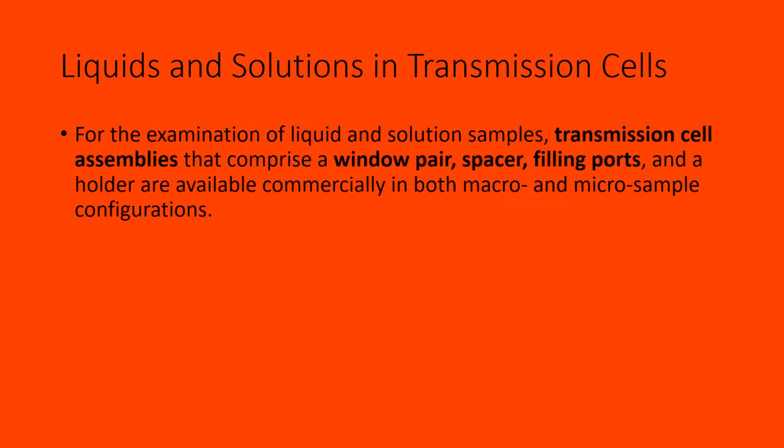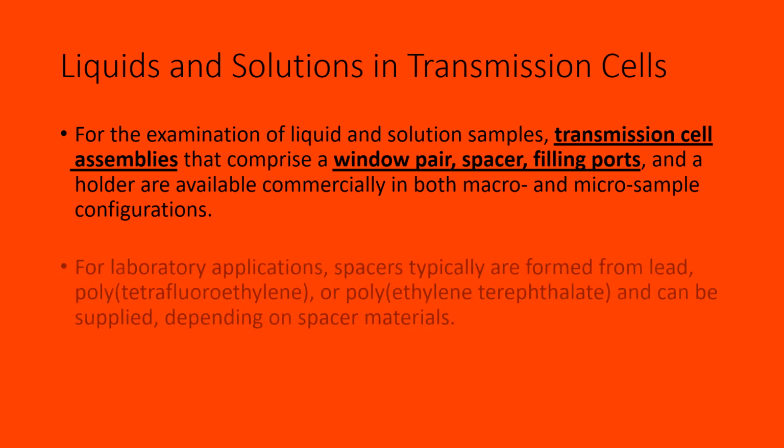For the examination of liquids and solution samples, transmission cell assemblies that comprise a window pair, spacer, filling ports, and a holder are available commercially in both macro and micro sample configurations.